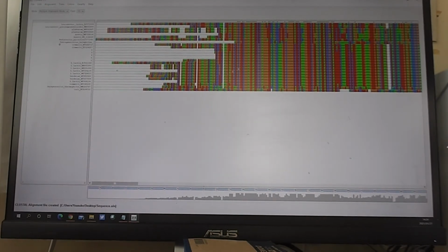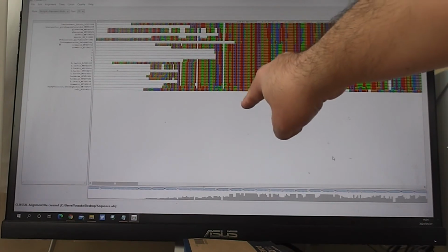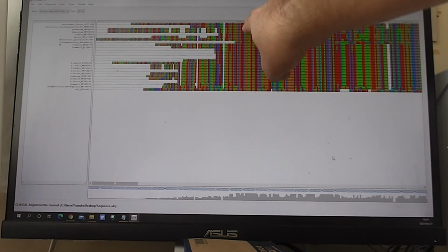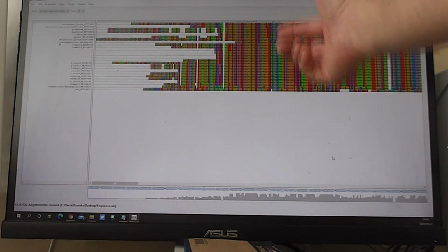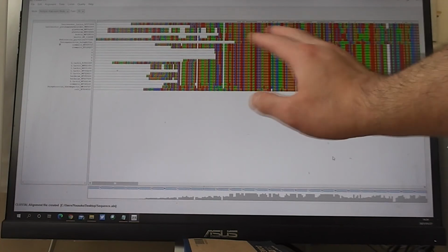As you can see, among all these strains, for example, around here, the nucleotide should be C in all strains at this position. The next one is G, the same information overlapped, but sometimes we can find differences among the species.